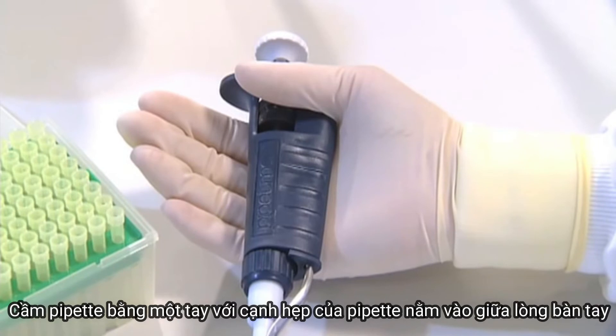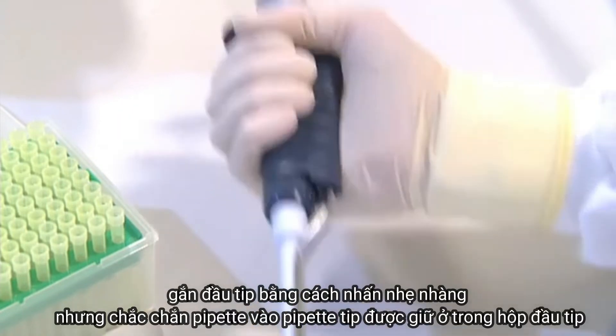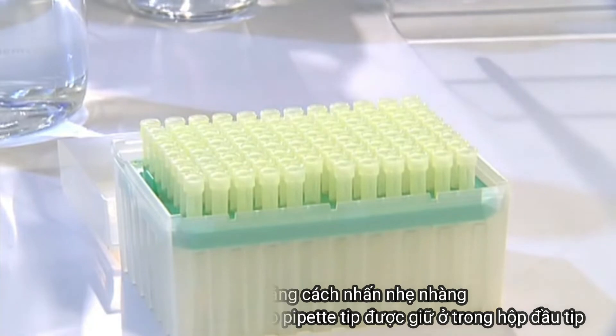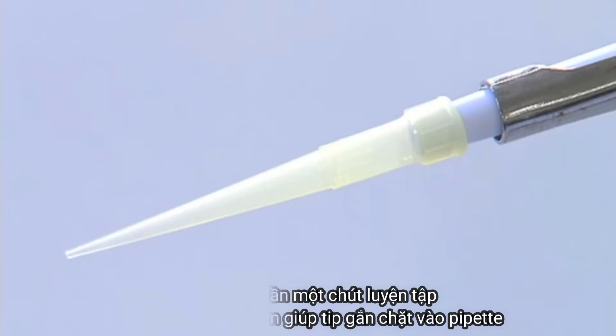Hold the pipette with one hand with the narrow side resting in the palm of the hand. Add the pipette tip by gently but firmly pushing the pipette into the pipette tip, which is held in a tip box. You may need a little practice to learn to apply the right amount of pressure to give a good airtight seal between the tip and the pipette.